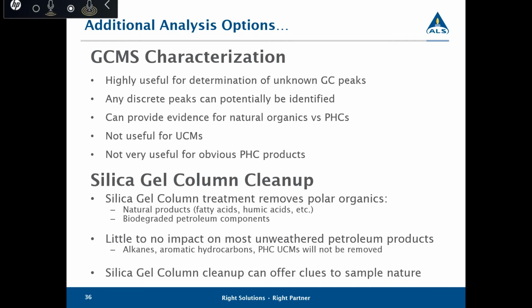It is very useful to provide evidence for natural organics versus petroleum hydrocarbons. It is not very useful when there is a UCM present, and also not very useful if we're analyzing obvious petroleum hydrocarbon products. The other option is to conduct silica gel column cleanup on the sample.